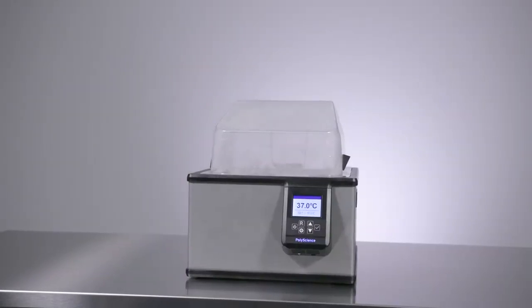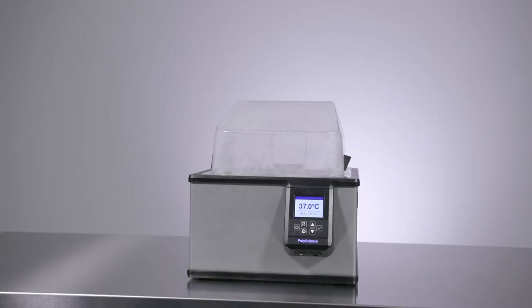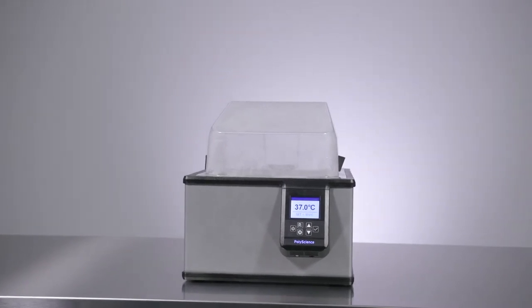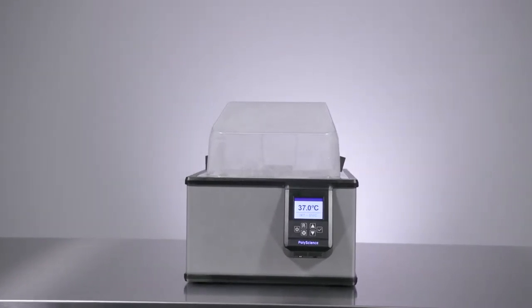Since the cover is clear, you can see your samples at any time without having to lift the lid and disturb your work.